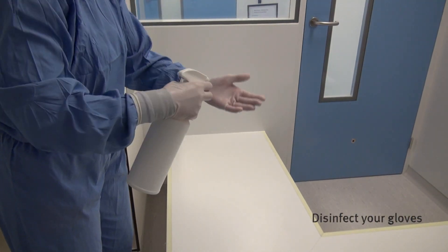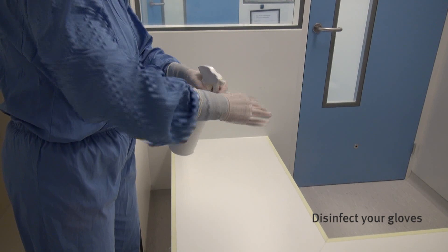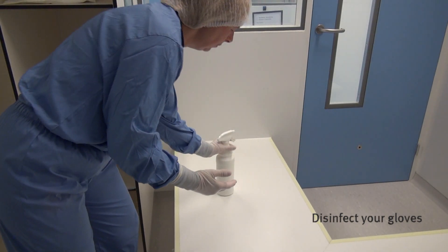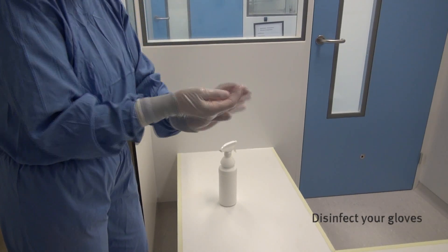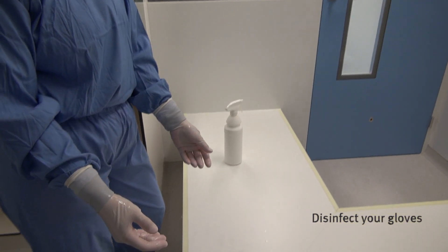Distribute the disinfectant over the whole surface of the glove. Be sure to use a sufficient volume of disinfectant in order to achieve the required contact time. You may proceed after the disinfectant has evaporated.